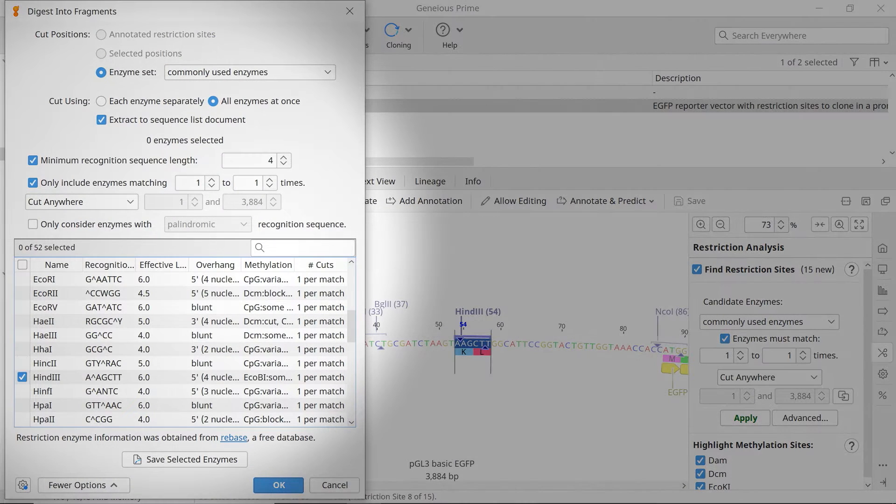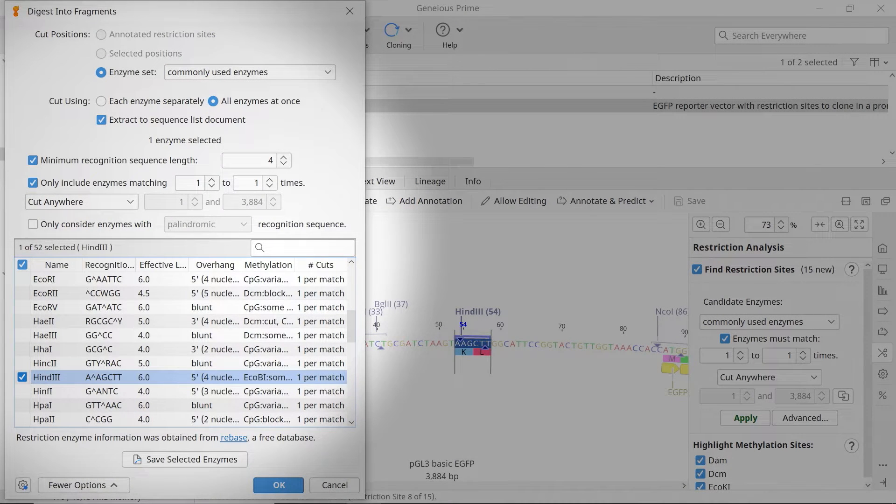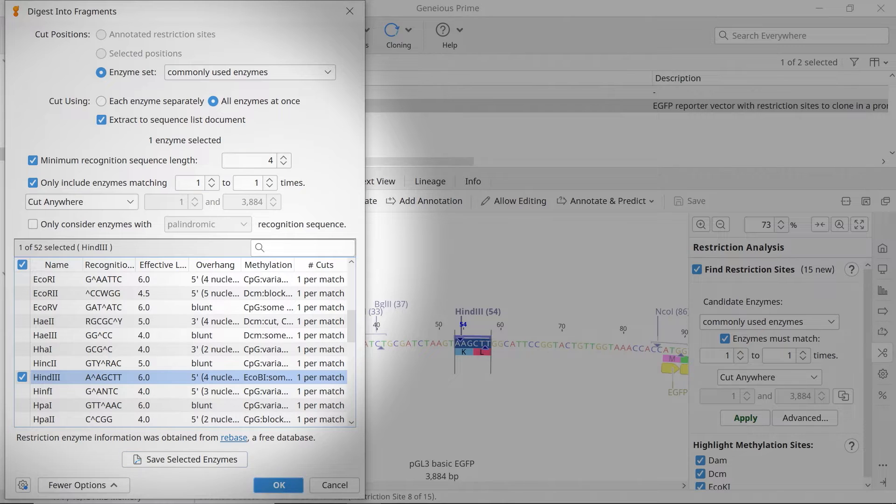In the new window, ensure your desired restriction site is selected and click OK.